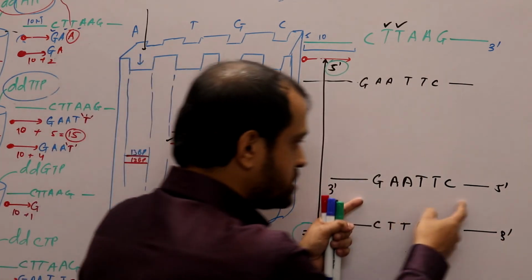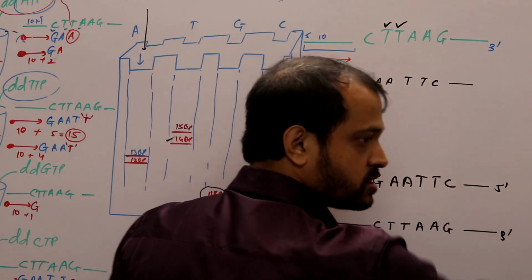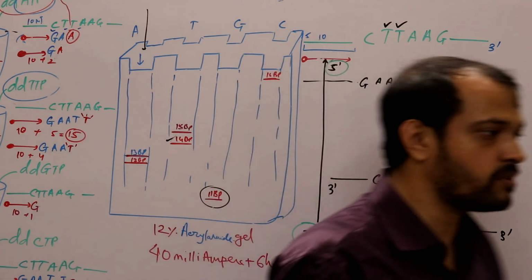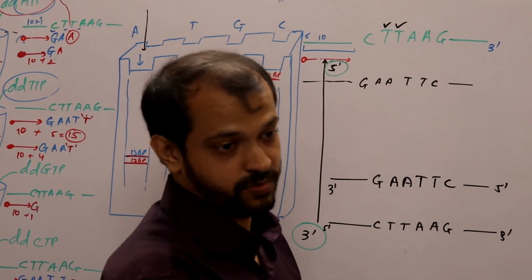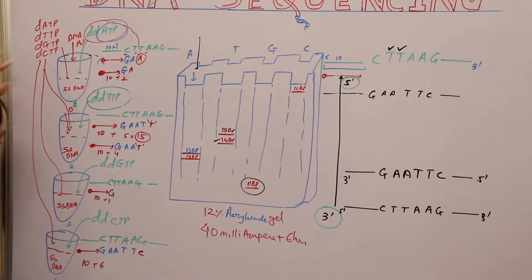If you are sequencing a long portion of DNA, then you will have to use software for doing this. If you are only doing it for 100 or 200 nucleotides, you can easily do that, right? But it is really time consuming. Why? Because this PCR thing takes time.